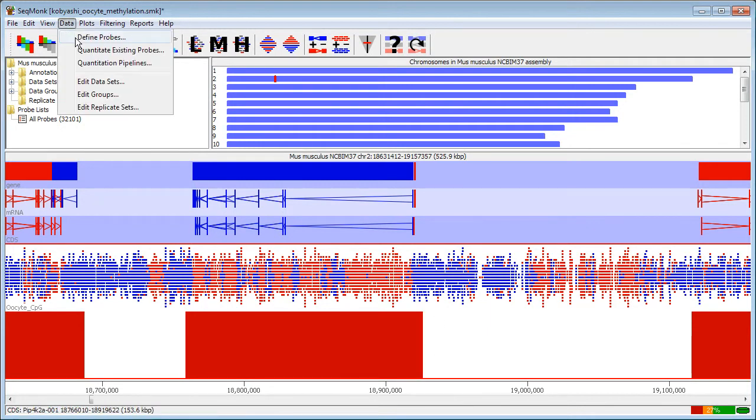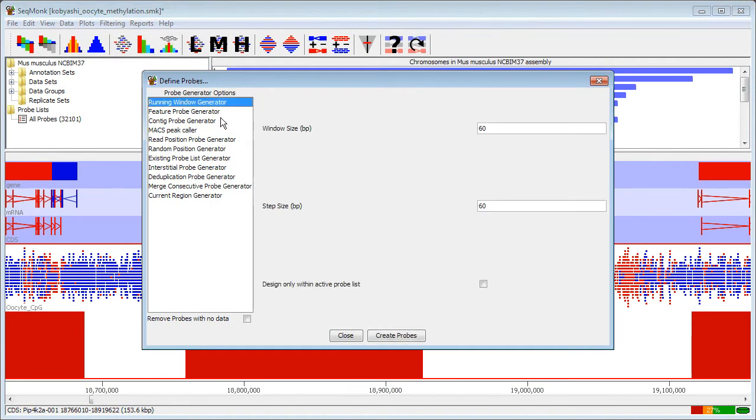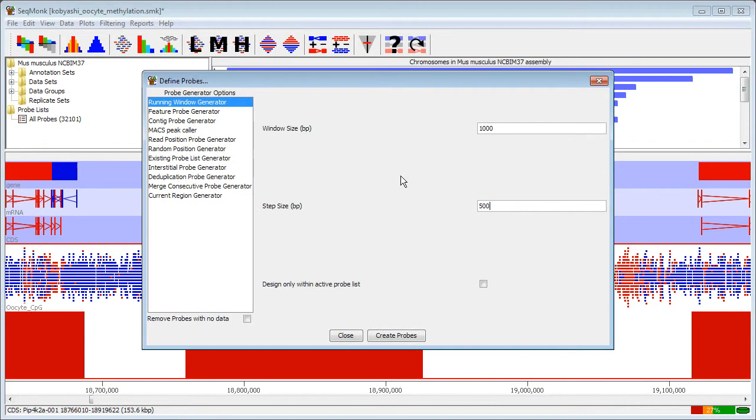So if I go back to define my probes again, I'm going to do a running window generation. I'm going to make one kilobase probes and place these every 500 bases just within the set of probes that I've currently got. So I'm going to tile probes over the gene probes that I've already made.